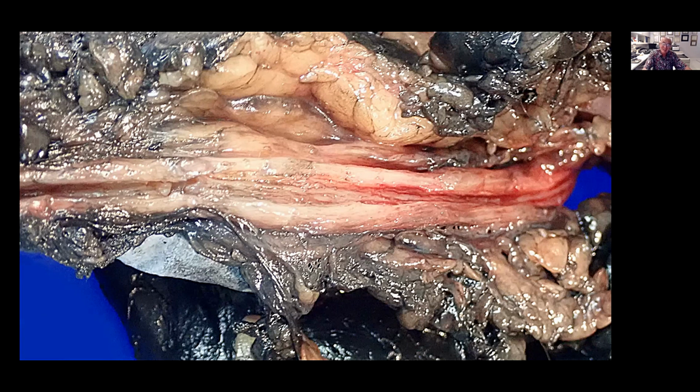So it's not just to check the kidney and the kidney is okay, take a representative section, but there is a reason for why the nephrectomy was done. So let's look at the ureter. In this particular case, it's a ureter that is very thick and very edematous, with some irregularities, which requires a very special dissection, etc., and description, and also the corresponding pictures.